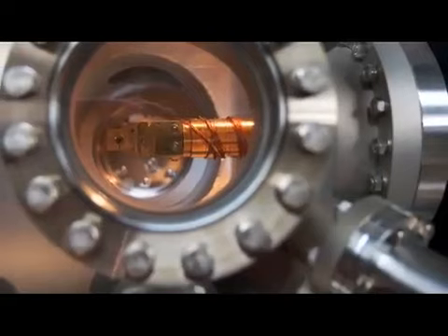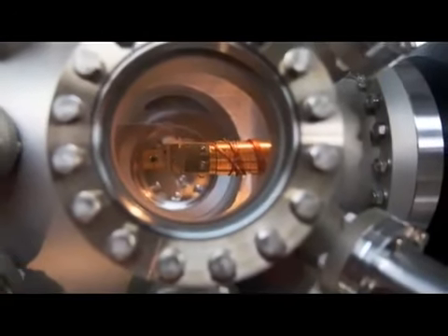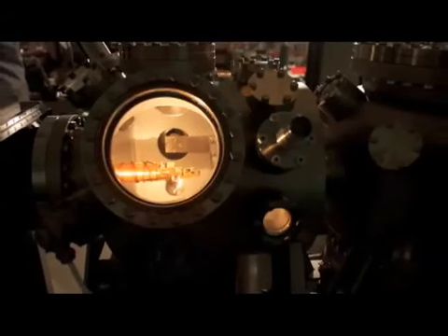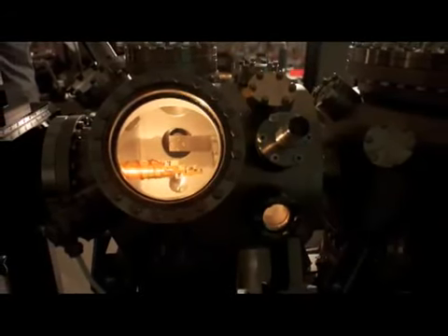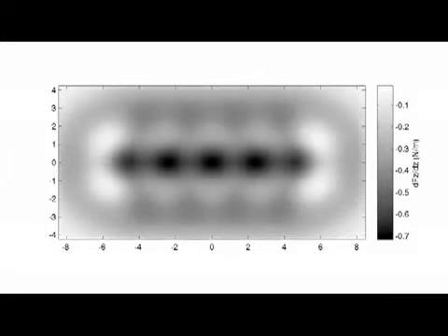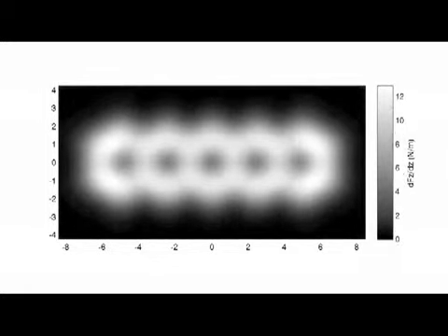To corroborate the experimental findings and gain further insight into the exact nature of the imaging mechanism, IBM scientist Nikolai Moll performed first principles density functional theory calculations. He comments, "The calculations helped us to understand where the contrast came from, and we saw that it was a quantum mechanical effect, the Pauli repulsion, which gives the contrast. In this animation we see a frequency shift in dependence of the height of the CO molecule over the molecule, scanning from large heights to small heights."